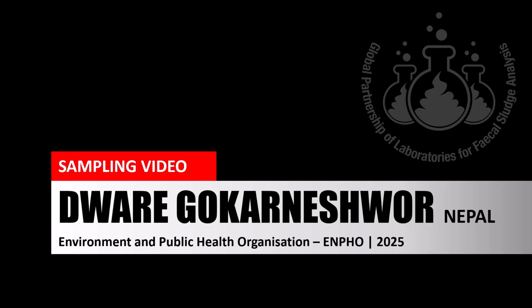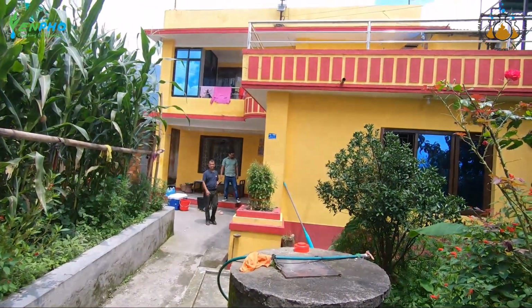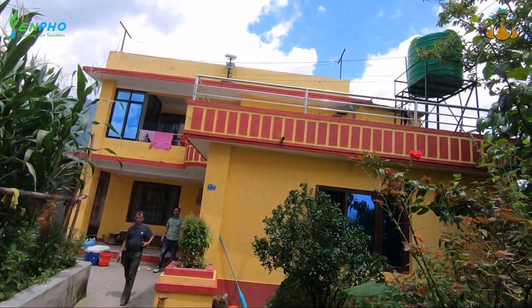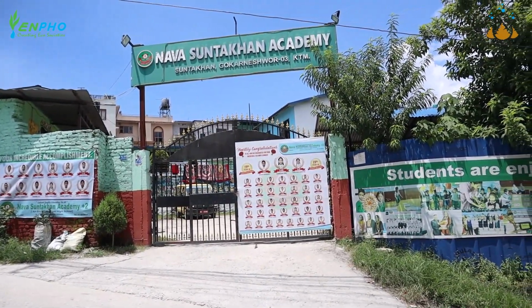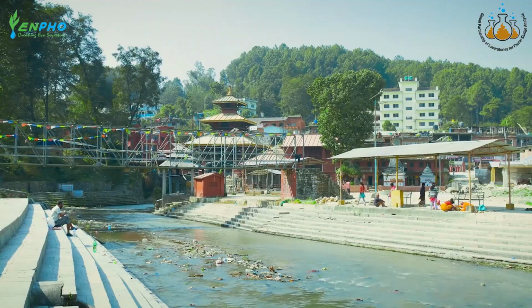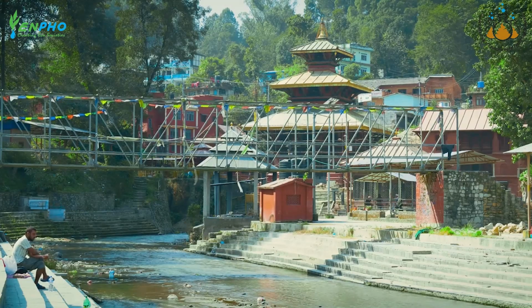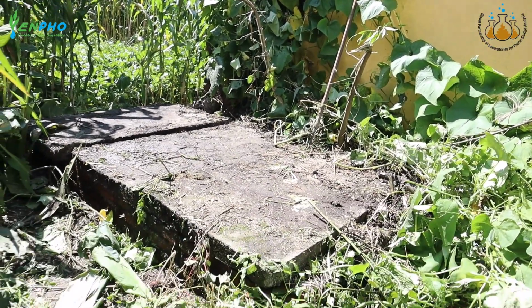Today, we are going to show you the entire process of fecal sludge sampling from the collection site in Dware Tole to transportation and storage at the ENPHO lab. The sampling site is located in Dware Tole within Ward number 3, Gokarneshwor municipality, about 2 km north of the historic Gokarneshwor Mahadev temple. The containment unit is located on the building premises at ground level.